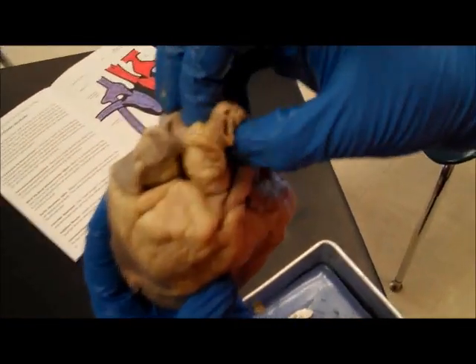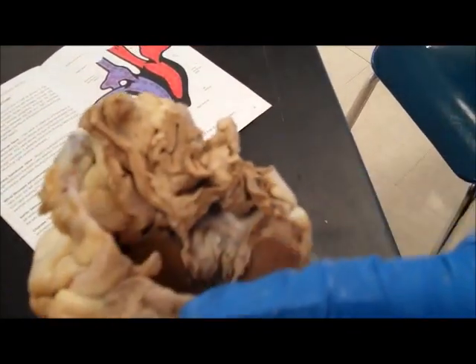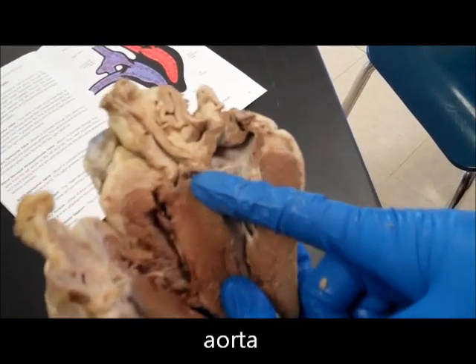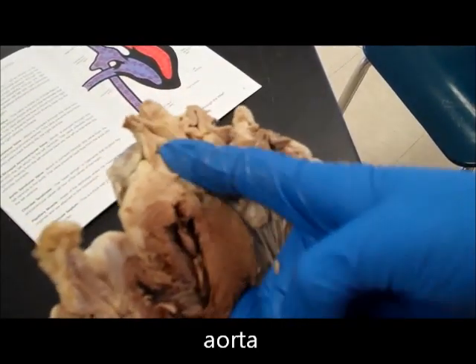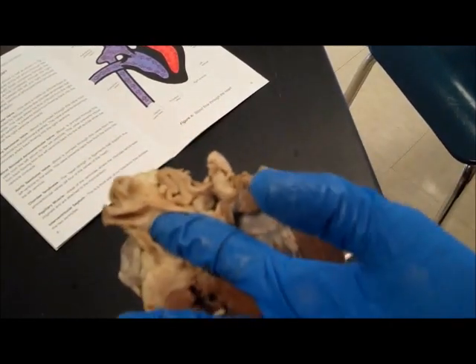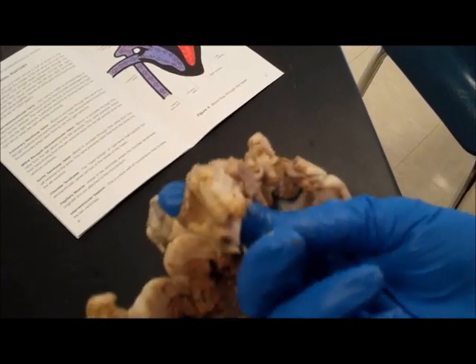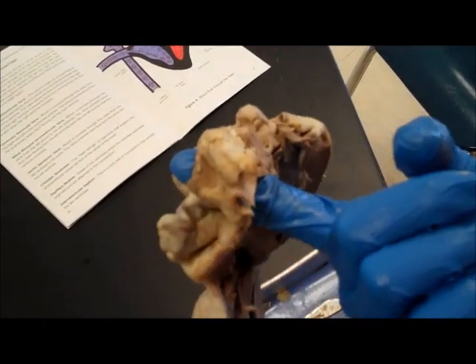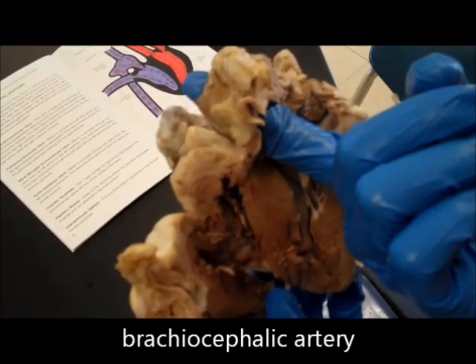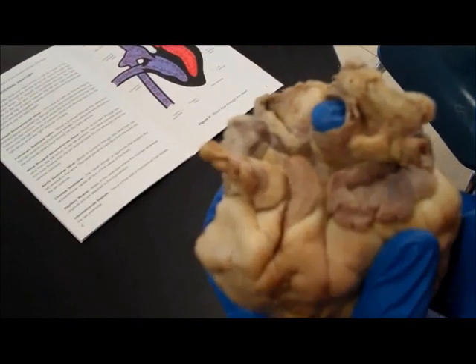We can see our aorta right here. Open it up again to see where that came from. It's kind of hard to see, but you're going to pump right up through here, and it's dissected on both sides. Notice there's also a flap right here. That's the brachiocephalic artery. Again, arteries go away from your heart. The aorta then pumps blood out to the rest of the body.